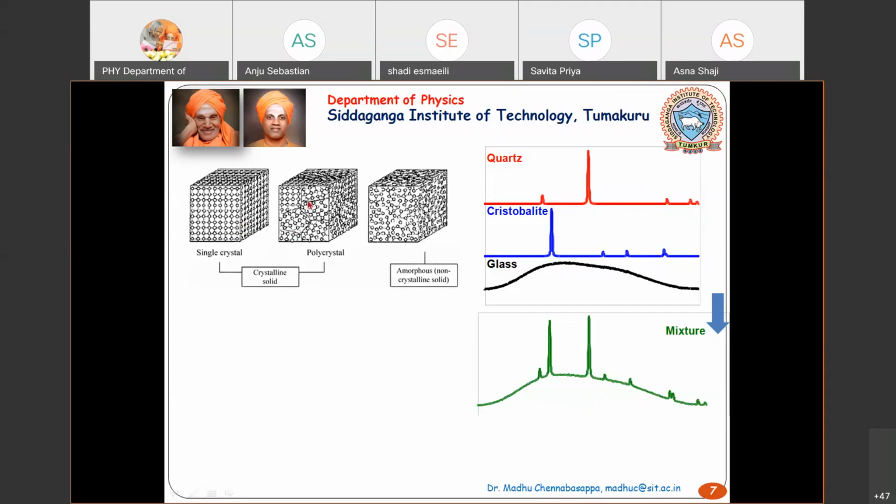Okay. So for example, if you take a polycrystalline, you can see the polycrystalline is just like small crystals. There are some different grains here. If I consider this is the first grain, this is the second grain, this is the next grain, then if I take this top grain, you can see these atoms have a regular arrangement, maybe like four rows in the same repeated arrangement.